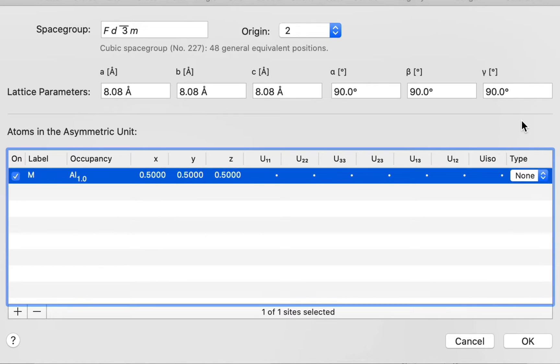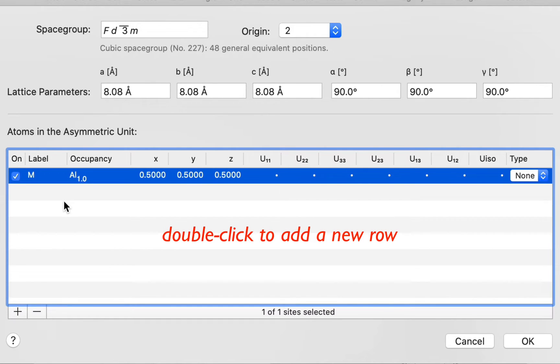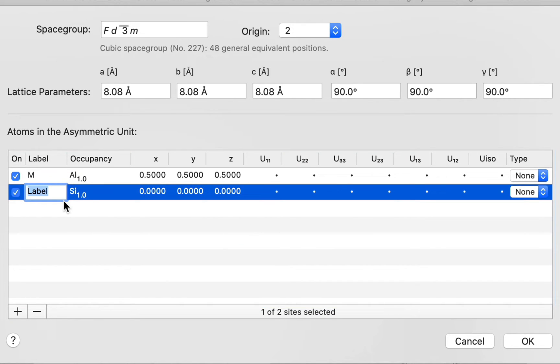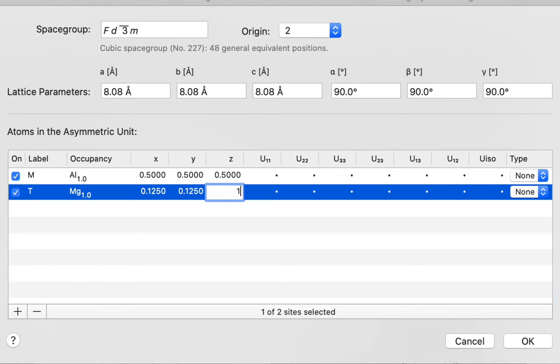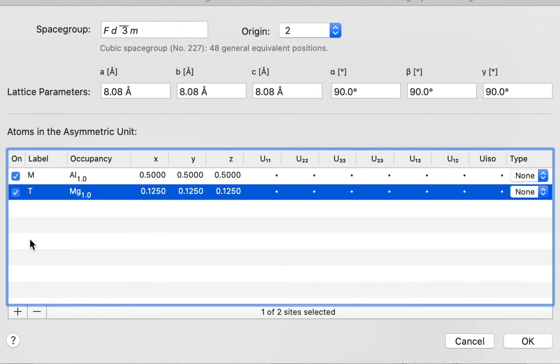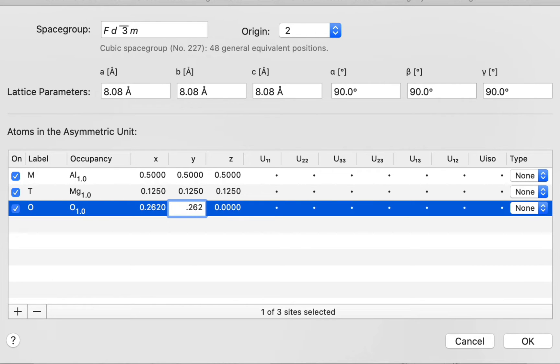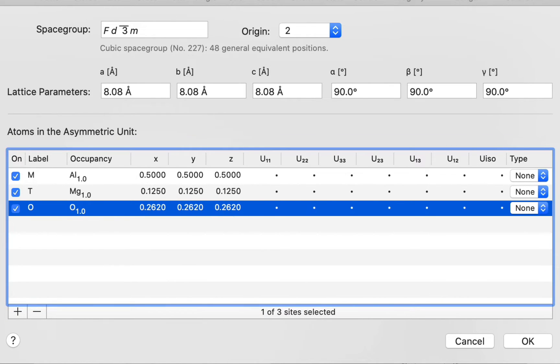Now we need to add two more sites. I can do that by clicking the Add button at the bottom of the table, or as a shortcut I can just double-click anywhere below the last row and a new site is created. Let's make this a T site with 100% magnesium at an eighth, an eighth, an eighth. And let's add one more site — 100% oxygen occupancy at 0.262, 0.262, 0.262. I hit Return and those are the three sites in my list.